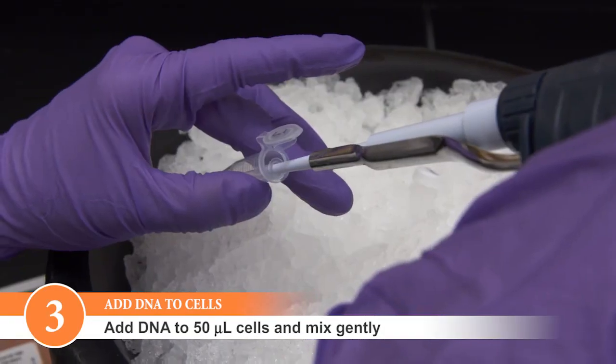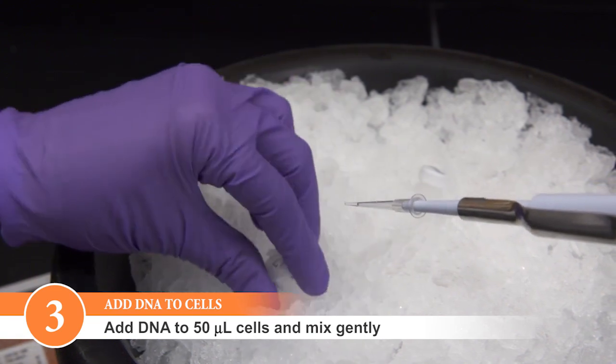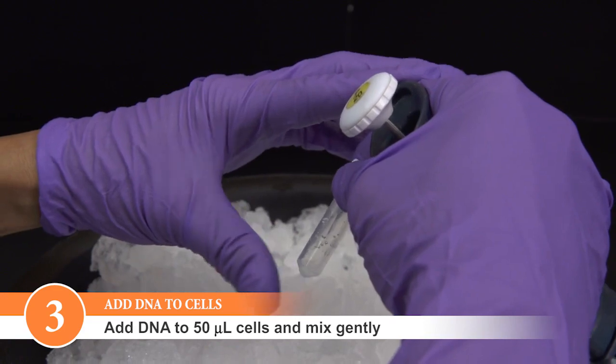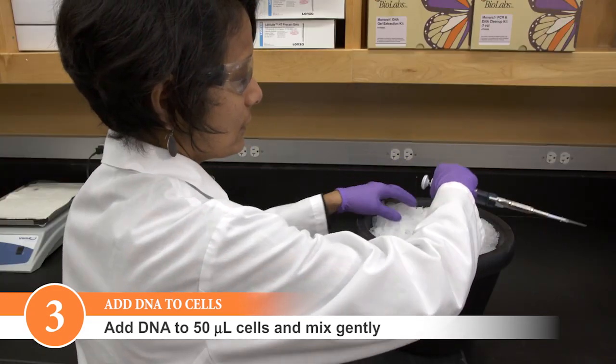Add DNA to 50 microliters of competent cells. Mix gently by pipetting up and down or flicking the tube 4-5 times to mix the cells and DNA. Do not vortex.